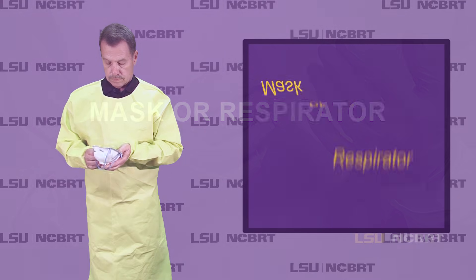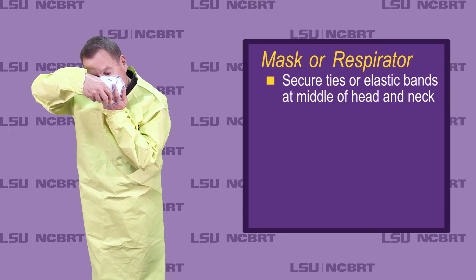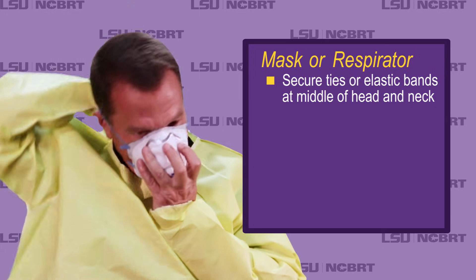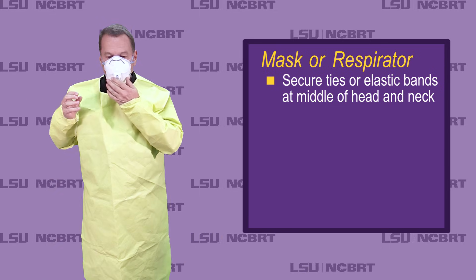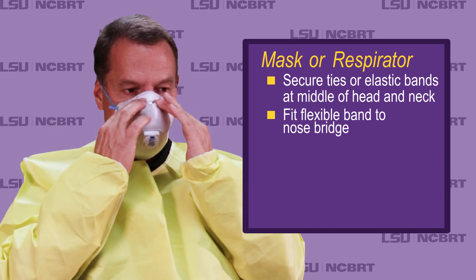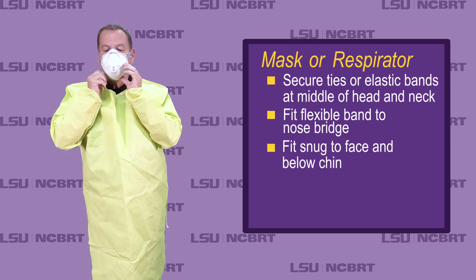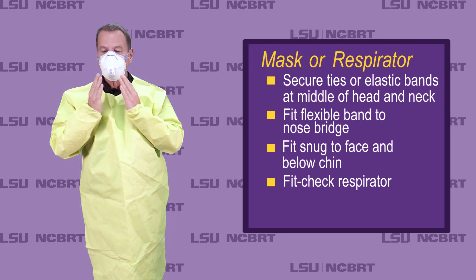Mask or respirator: secure ties or elastic bands at middle of head and neck. Fit flexible band to nose bridge. Fit snug to face and below chin. Fit check respirator.